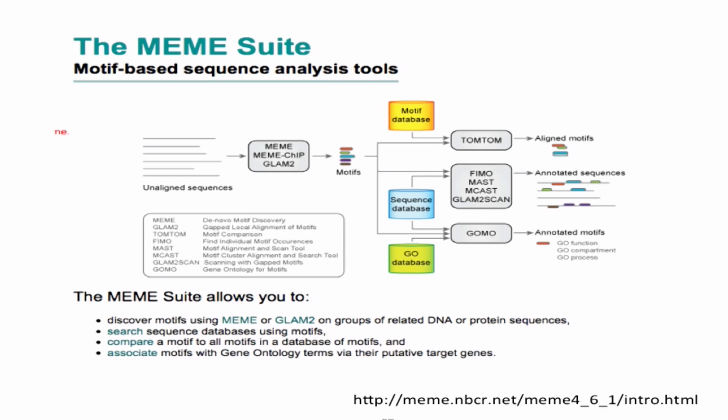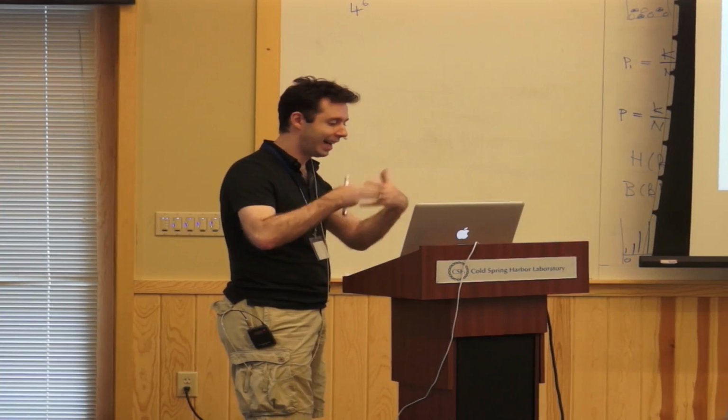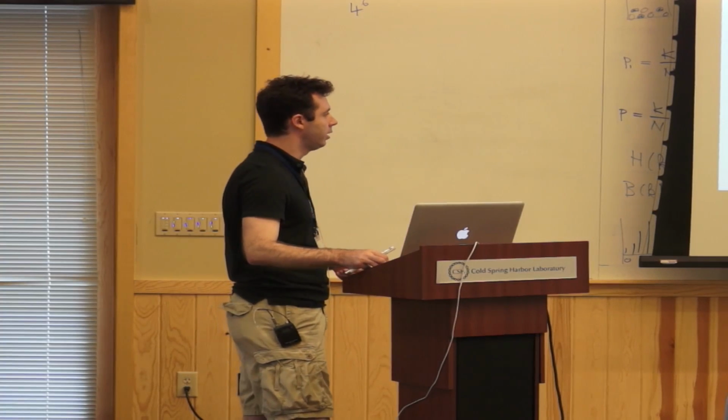And a tool like TomTom, which is integrated into MEME, allows you to do these comparisons, the scanning of databases. Also, some of the tools in this framework, which is available at this address, allow you to do pathway analysis of the peaks that have a given motif, as a way to dissect further the biology of the peaks.